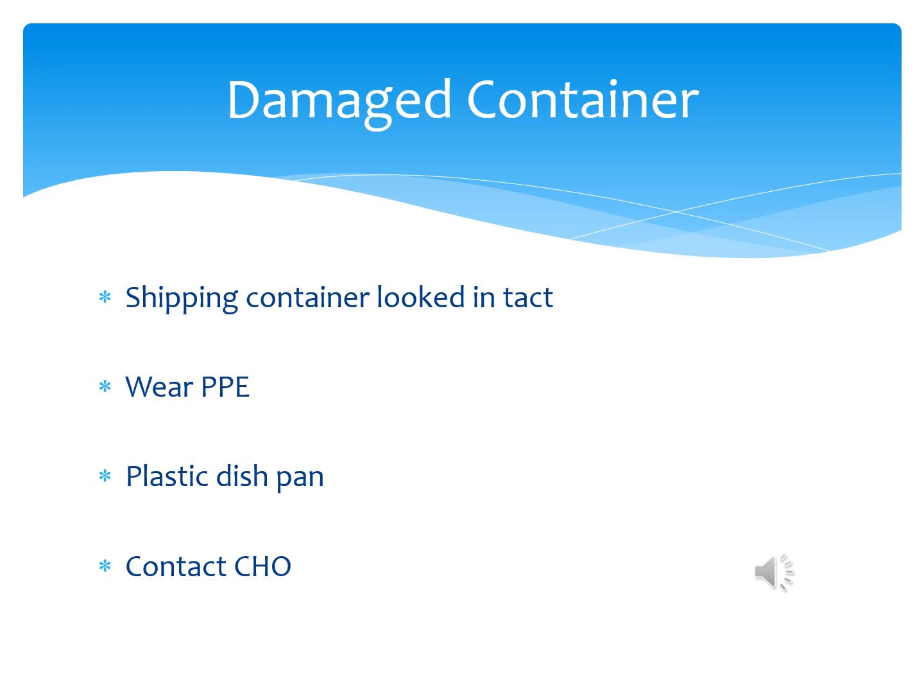Sometimes the packaging looks fine, but the container is damaged or starts to leak. In these situations, be sure you are wearing proper personal protective equipment and place the leaking item into secondary containment such as a plastic tub. Contact the Chemical Hygiene Officer. In events where the chemical poses an immediate danger, follow the spill plan and evacuate. We will cover the spill section on an upcoming slide.